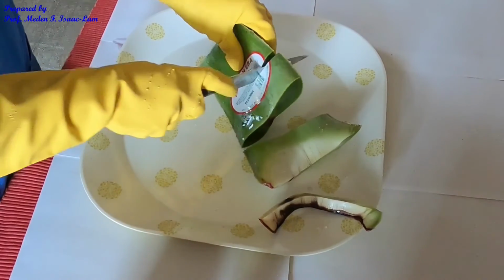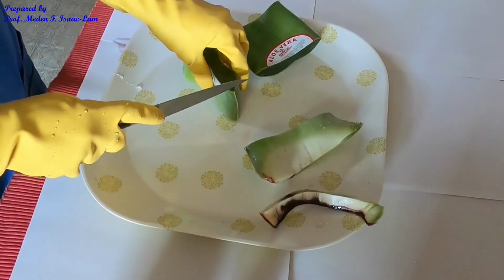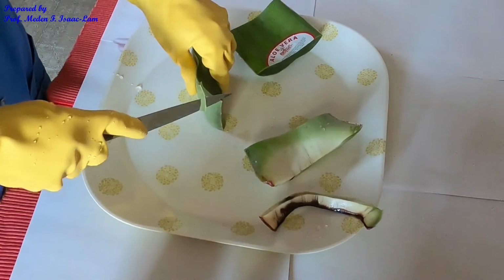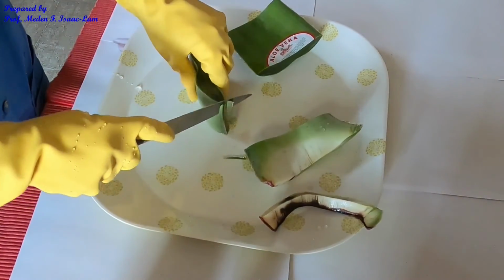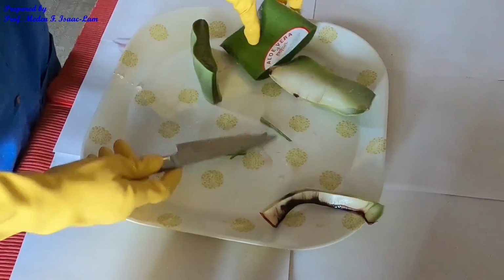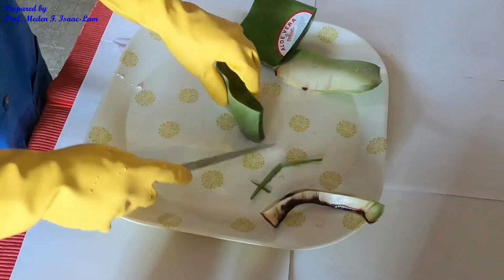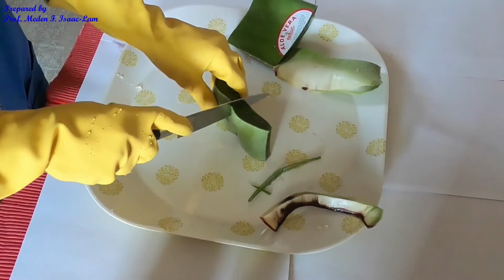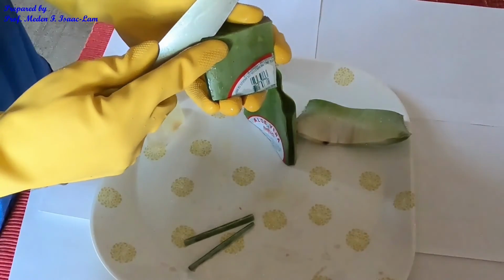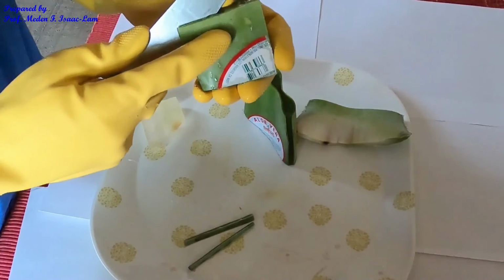Like that. And then you can cut the spikes. It's sharp, so you have to be careful. You can do the same thing for this piece. You can cut here. You can also cut here, and then clean up the spikes. And now this is the gel. It's very slippery. And then you can take out the outer layer. This is very hard.